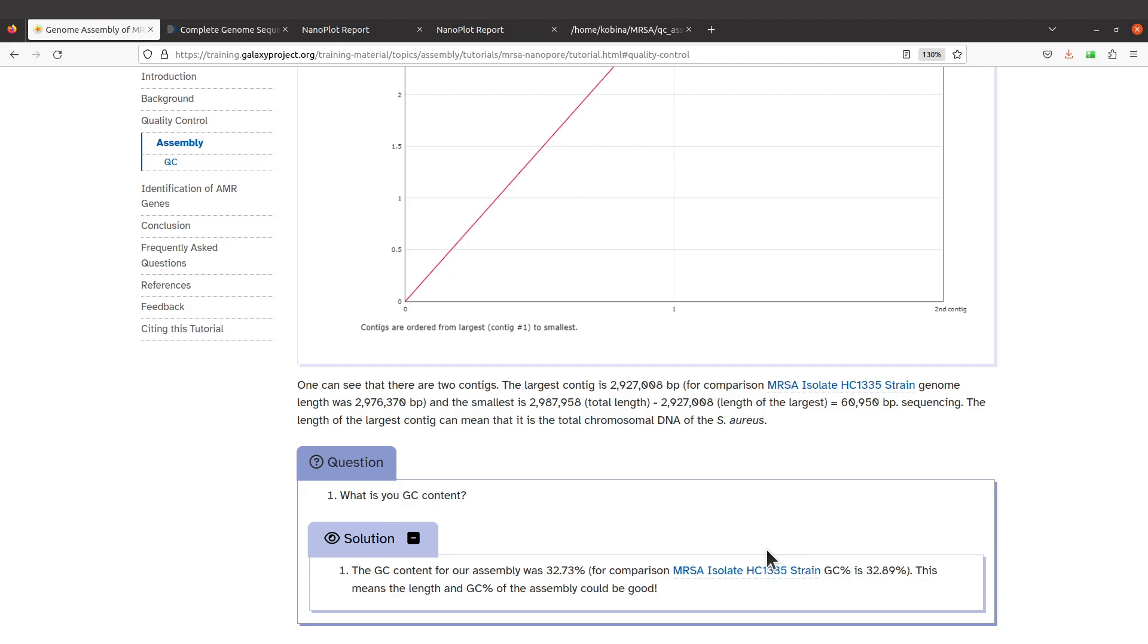to what you have, and then maybe you can investigate why there's that difference later on. That's it. Another thing you can also use to compare is the GC content. Let's take a look at this question. It says what is the GC content.